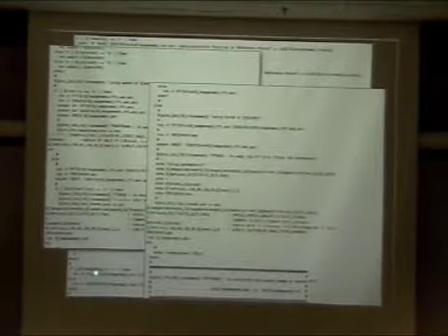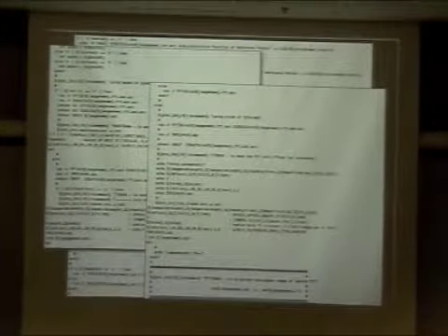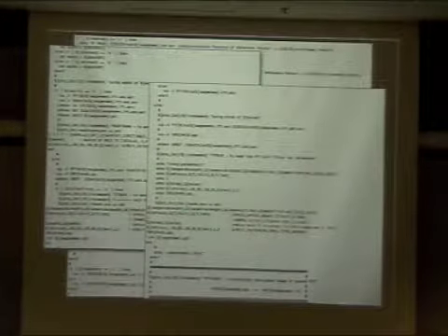There are parameters that you really want to keep track of, and most importantly, even as you're processing these things, if you want to suddenly make massive changes to system-wide parameters or images or any kind of conditions, you really do have to carefully go through this again. And so again, 2DX is trying to step in not so much as an image processing platform as such, but more a way of keeping track of everything and allowing you to experiment more effectively.